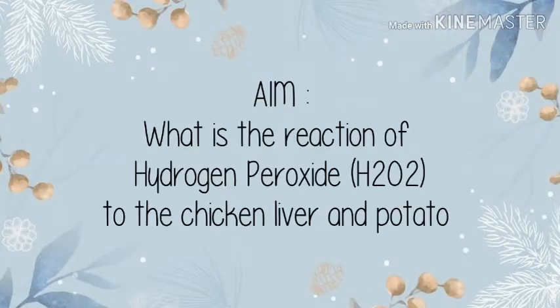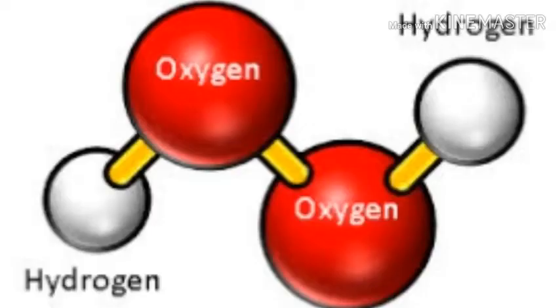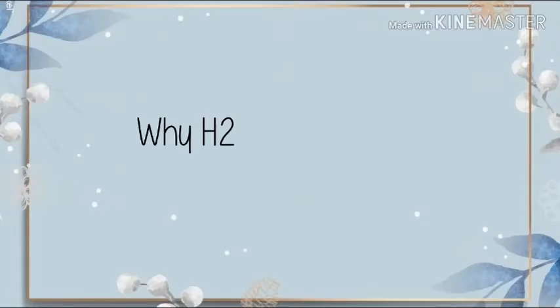The aim of this experiment is to see the reaction of hydrogen peroxide, or H2O2, to the chicken liver and potato. What is H2O2? Hydrogen peroxide is a simple compound. Its physical properties are that it's a liquid but more viscous than water.